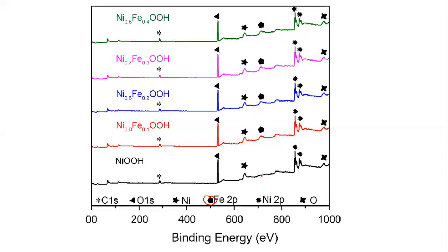Here you see that it's a flat line. That is flat over here, almost flat. But here we see a peak like this. And here again there is a peak like here. And there is another peak over here. So you can easily understand that there are different peaks. The rest of the peaks are the same.